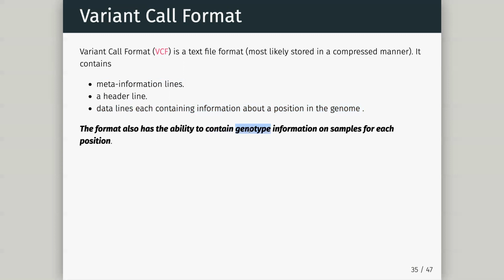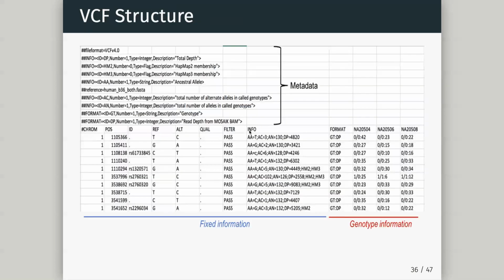So information on every single sample can be contained in a VCF. You can go in there, look up your mutation of interest, and then see which samples are assigned that particular change. What I really like about VCF format is it explains itself, which is always good.